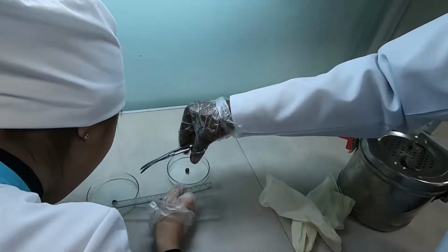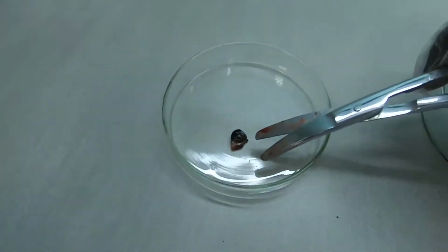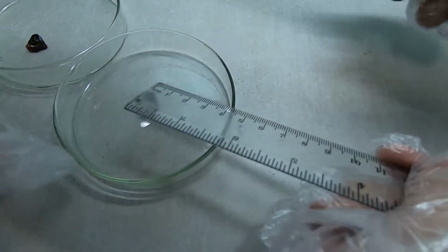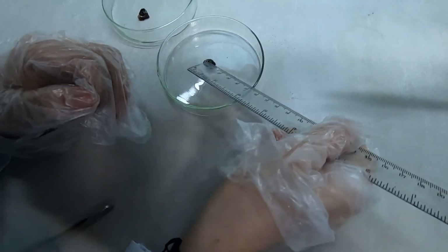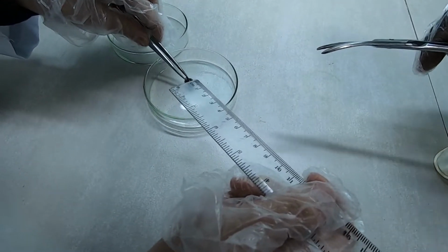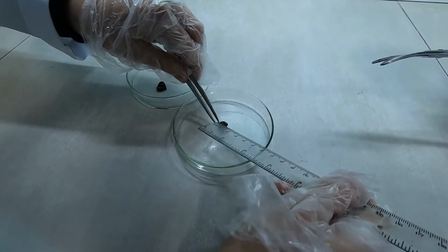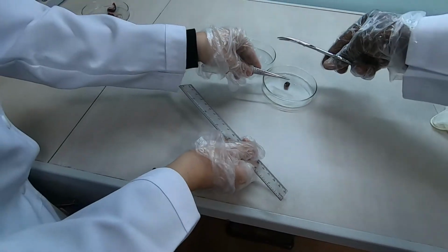We are going to measure 3 millimeters of the eyeball, the length of the eyeball, both. And this one too. You can use the smaller one if you want. 3 and 4 millimeters.